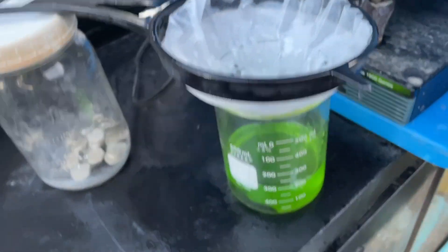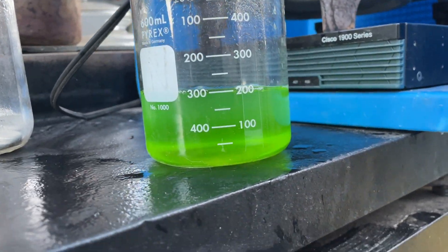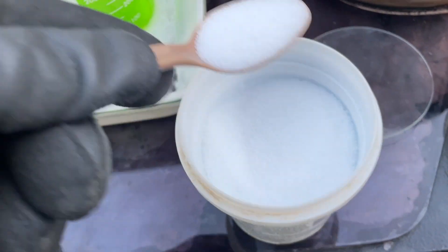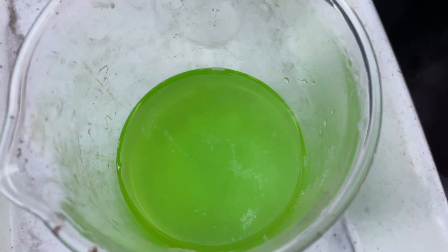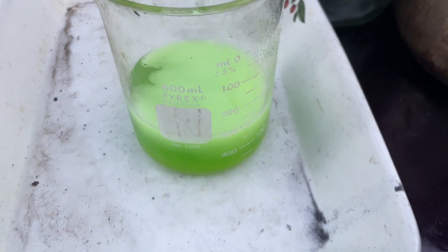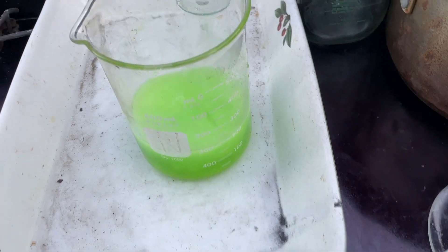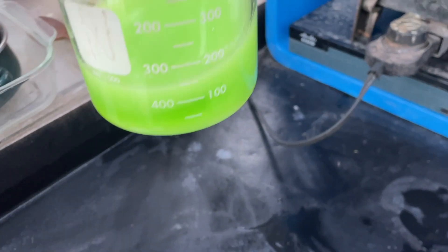It looks like we got that all through the filter — fairly clear solution, not perfect but not horrible. Good enough for our first crack. Looks like there's a little bit of urea there. That's some active nitric — that's what it does when you got active nitric. That will neutralize it pretty fast.